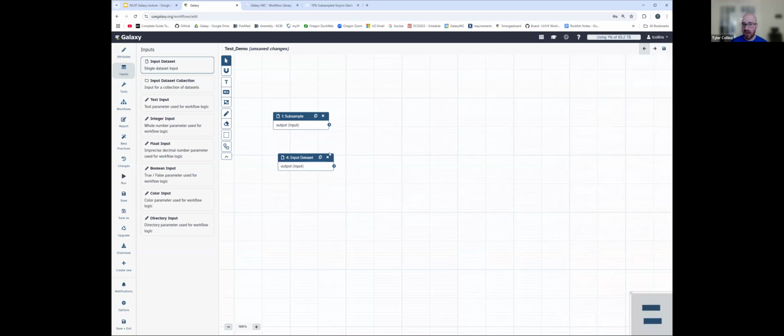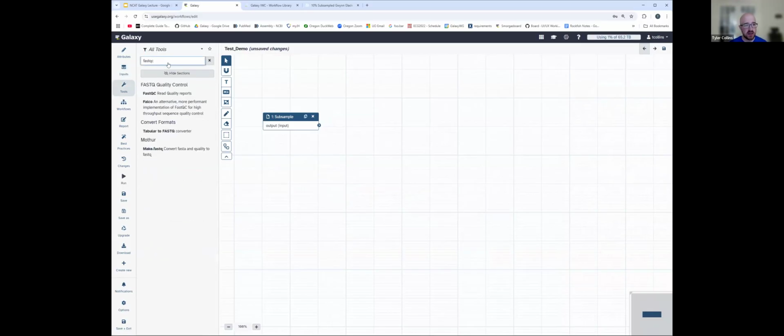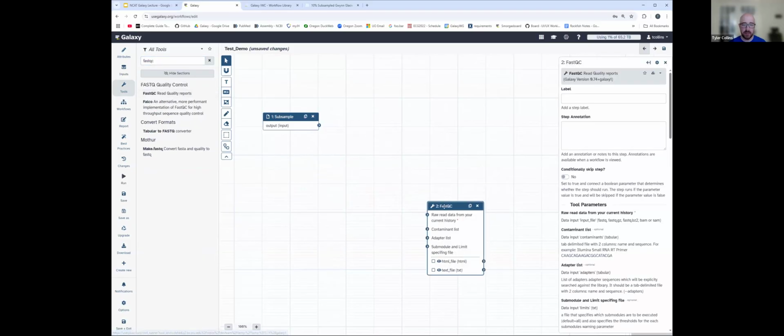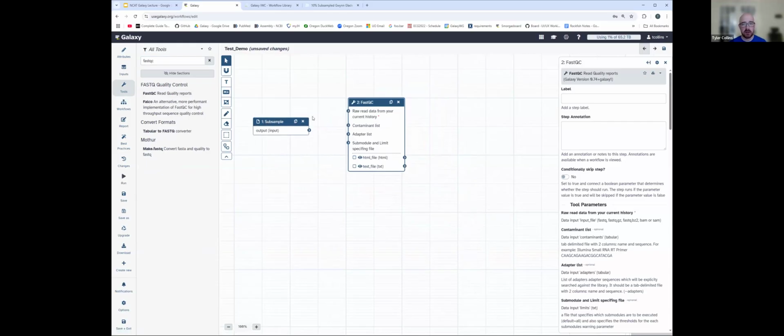After we have our first data set, the first thing we did was obviously run it through FastQC. So we can search in here, on our inputs, just tools, like the regular tool search, and we can click FastQC. It will generate FastQC and stick it here on this grid structure as well.